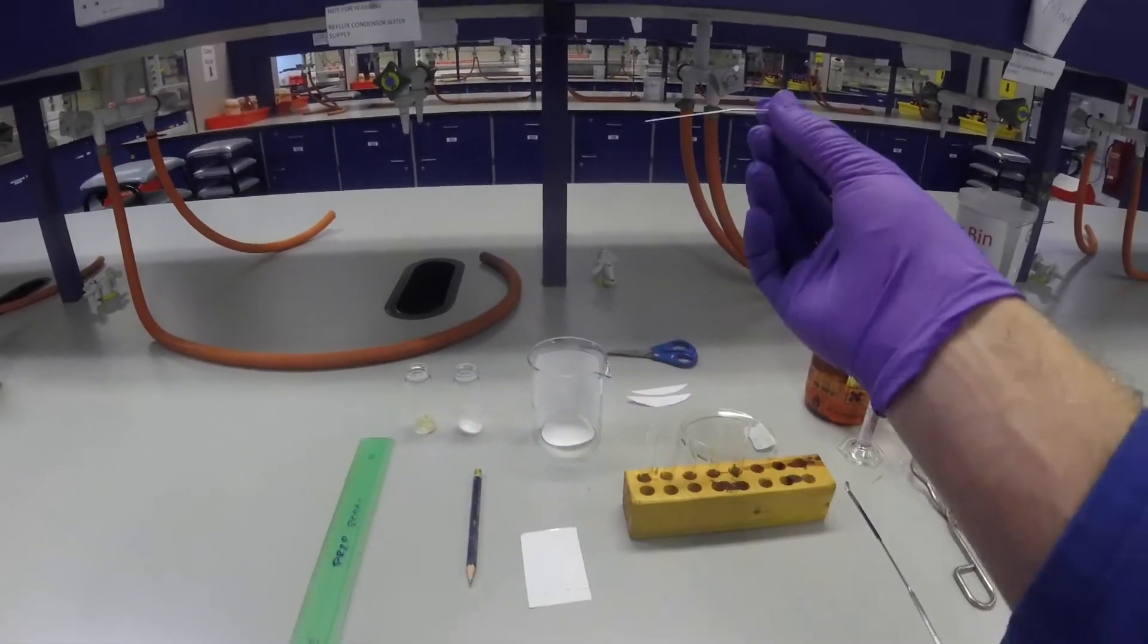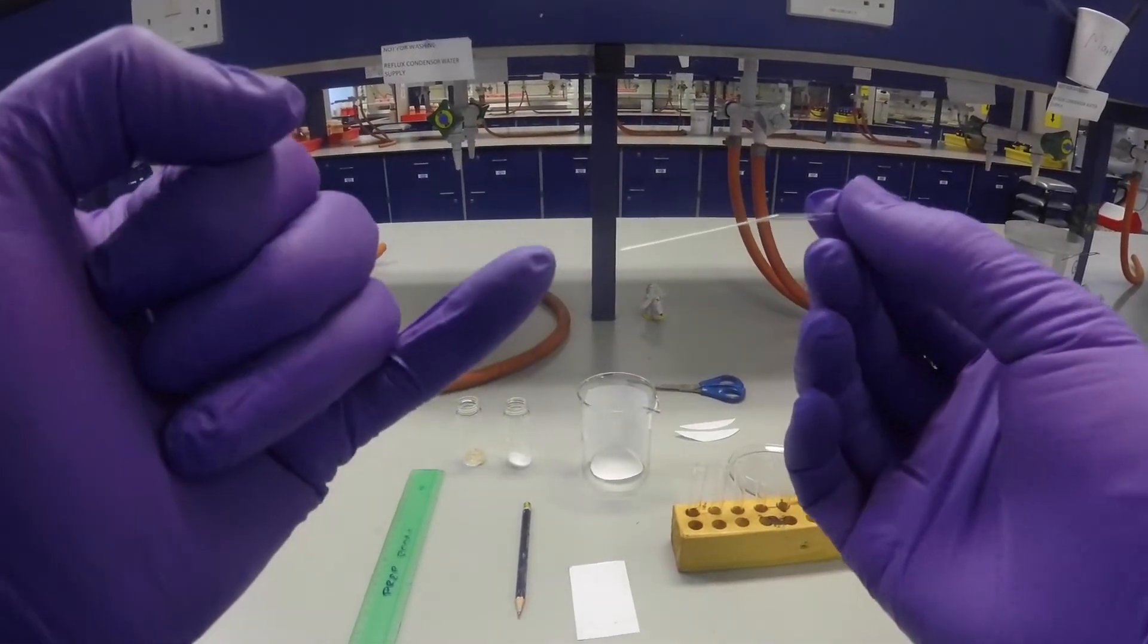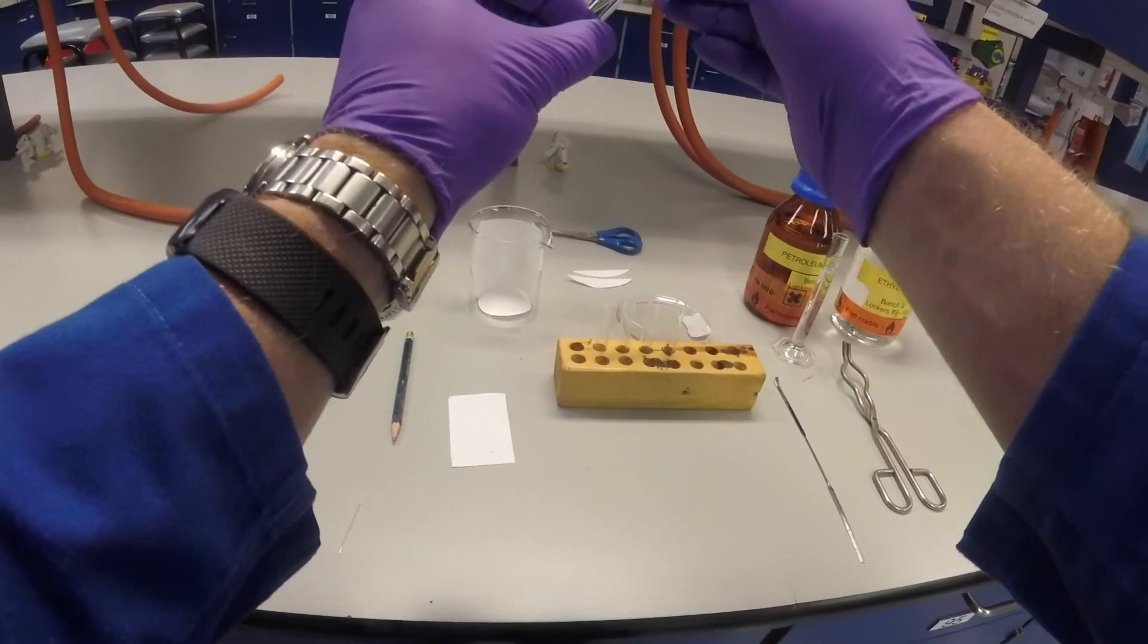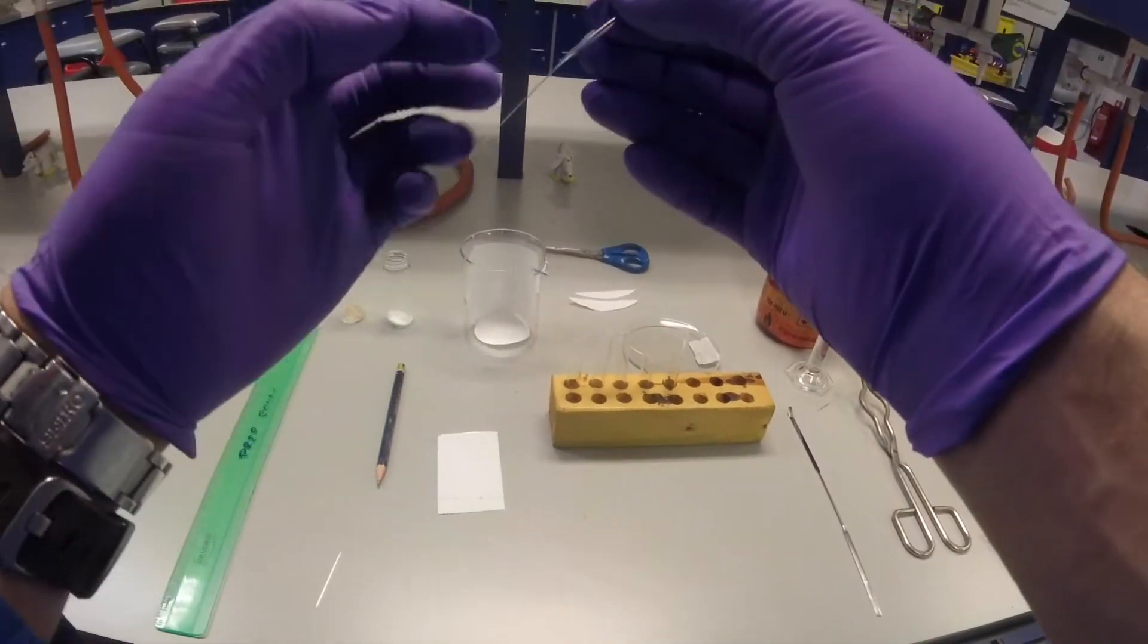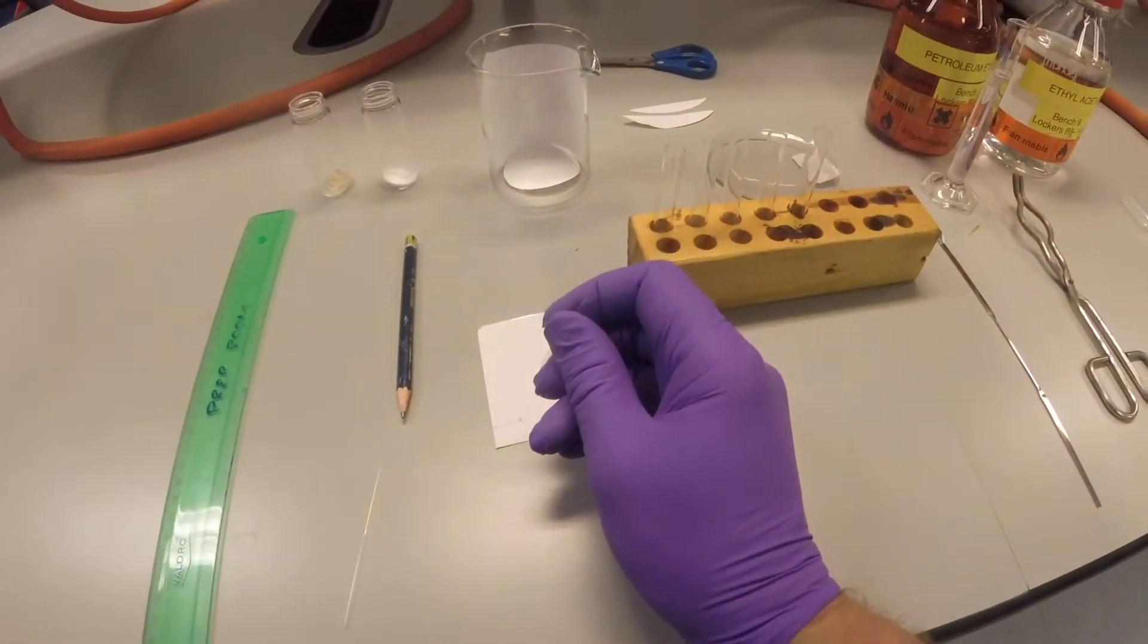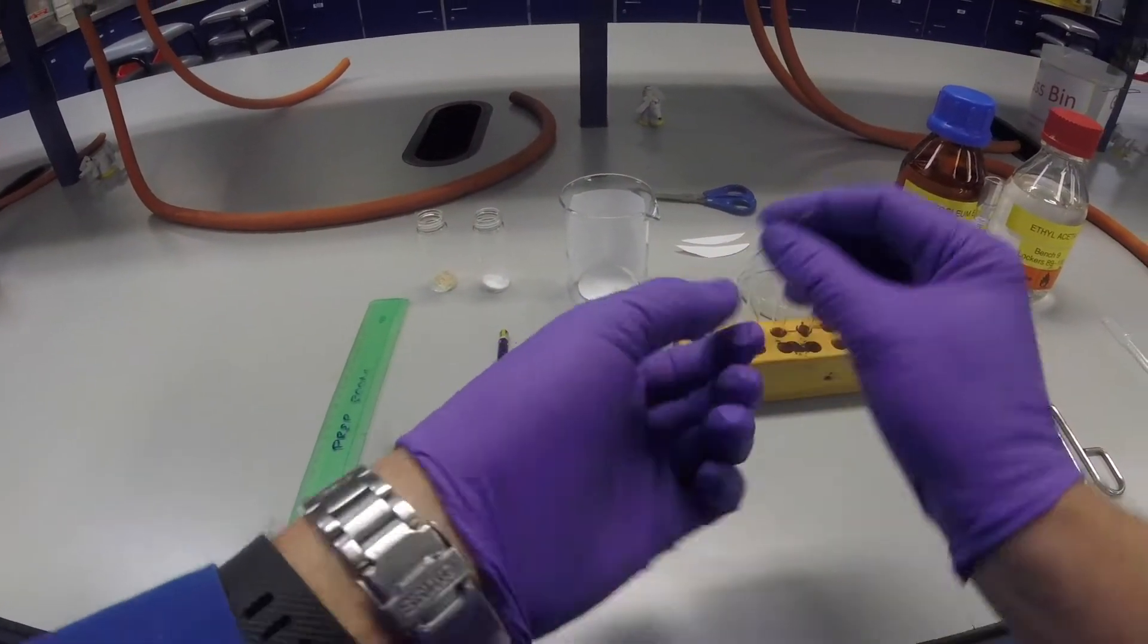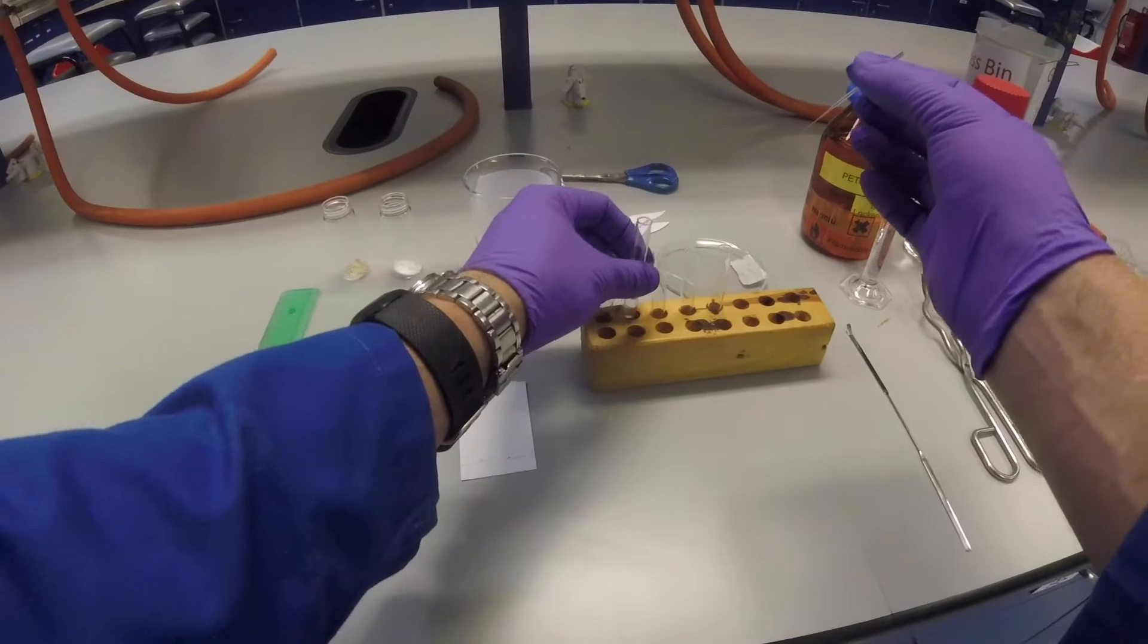We take our TLC spotters, a capillary tube that's been drawn out with a flame to make it much smaller with a very fine edge on the end. We dip it into our solvent and capillary action draws up the tube. Then you very carefully place that on the line where you've got one of the spots, allow the solvent to run out and form a spot there. That solution needs to evaporate, and your compound is loaded onto the TLC plate.